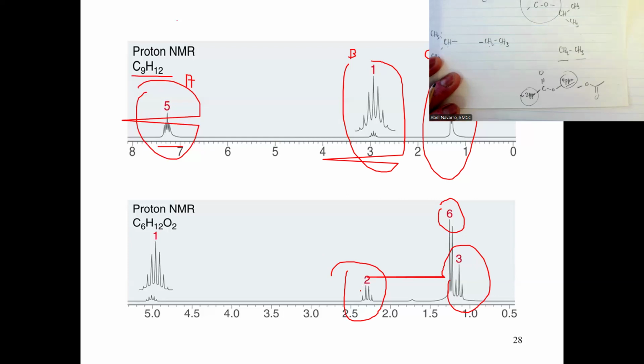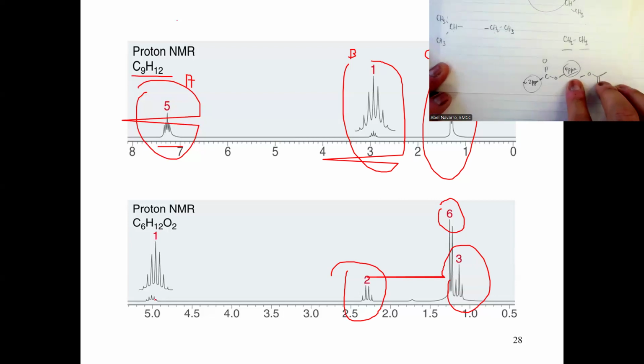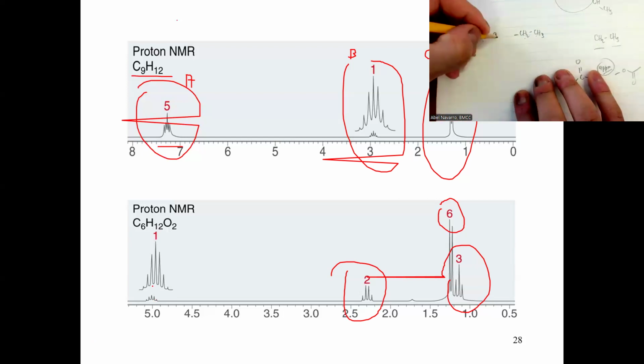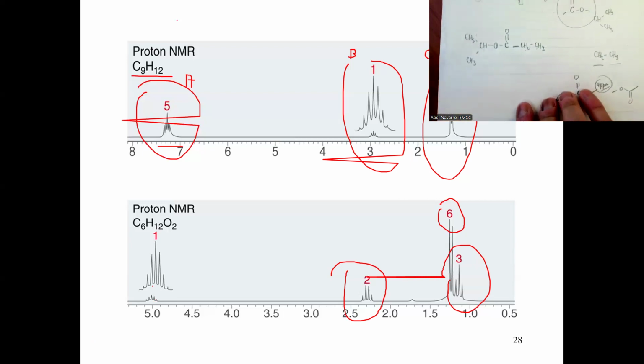Here, see, the CH2 is closer to the 2 ppm. The CH is close to the 5 ppm. So definitely, this is telling me that if the higher ppm is next to the O, that means that the isopropyl is next to the O. So it should be here O, COO. That should be the structure. Okay, the structure should be for that.